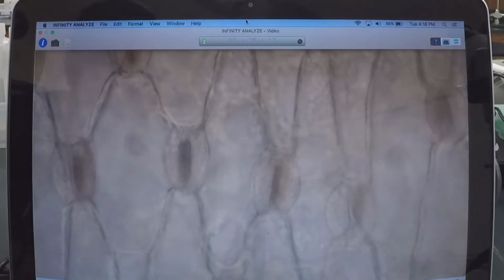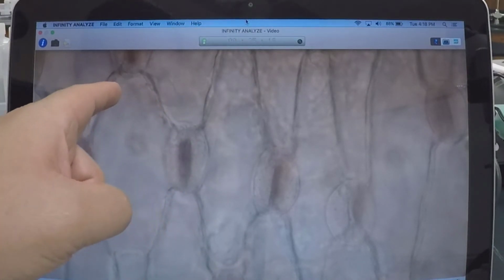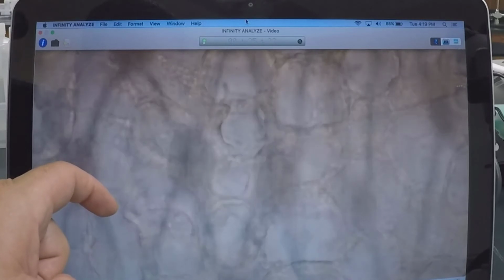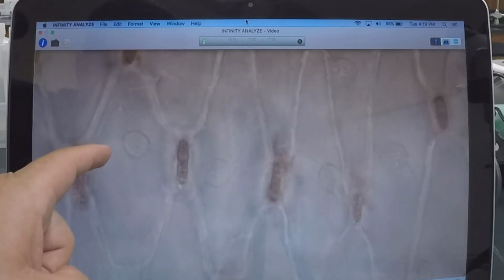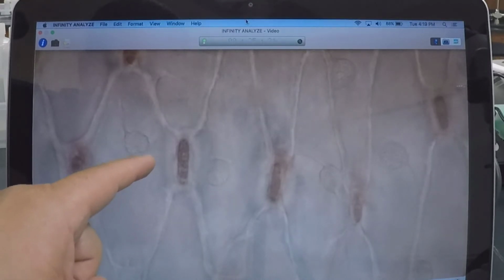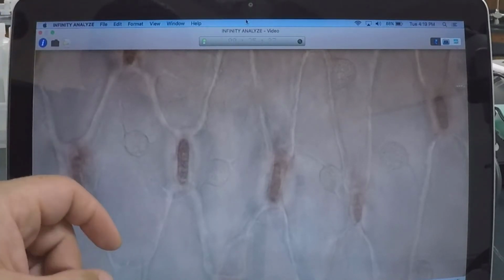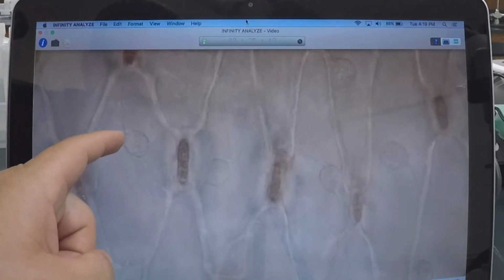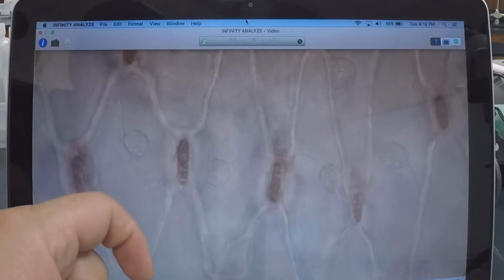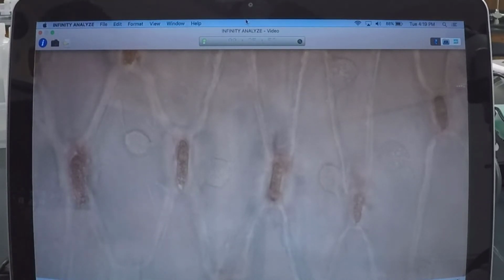Okay, so that's the plant. Pretty easy. You can see they have rigid, straight cell walls, and on the inside of those cell walls they actually have a cell membrane. Inside that cell membrane they have cytoplasm. That cytoplasm is kind of like a jelly-like substance, and they'll have chloroplasts and other organelles. I mean, they have all their organelles, Golgi apparatus, everything inside of there. The nucleus is really showing up well in a lot of these cells. There you can see the nucleolus, the region where ribosomes are made. So you can see quite a bit in these plant cells.